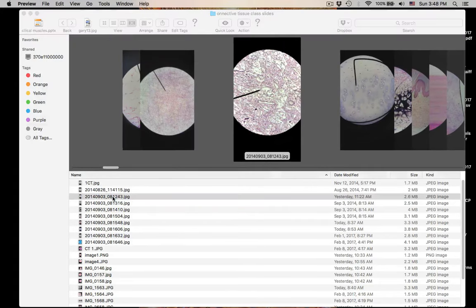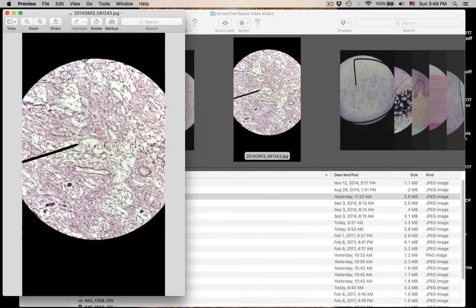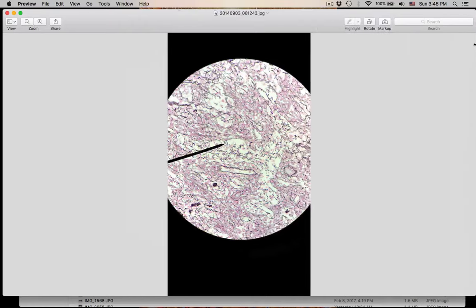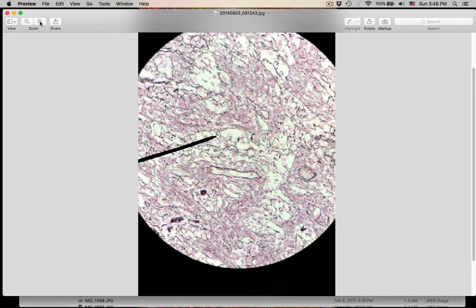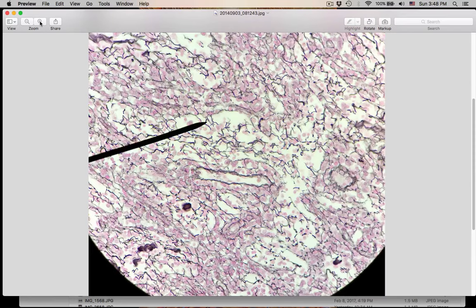Number three. This is so nice — this is a great one. What is the name of this connective tissue?